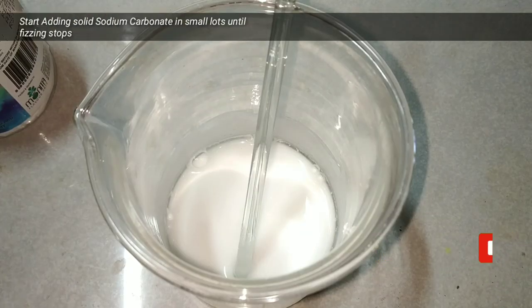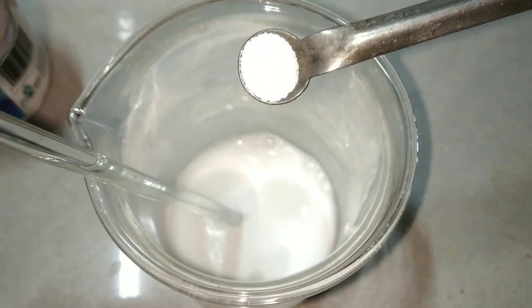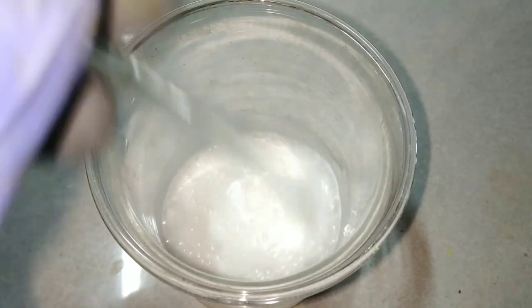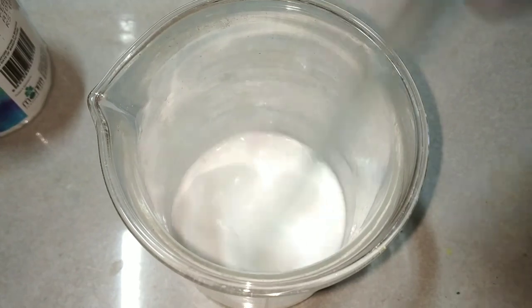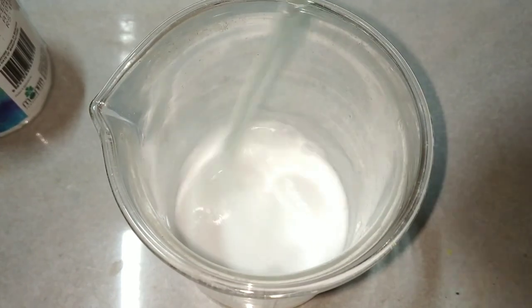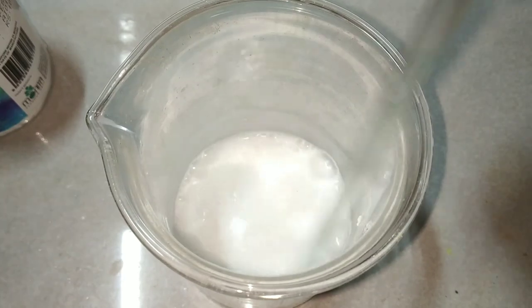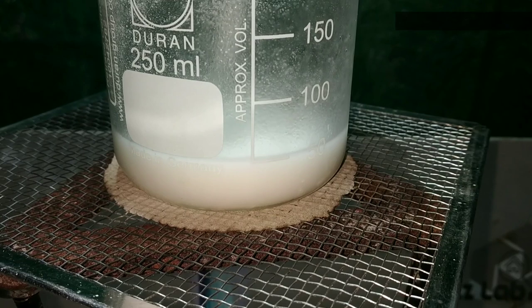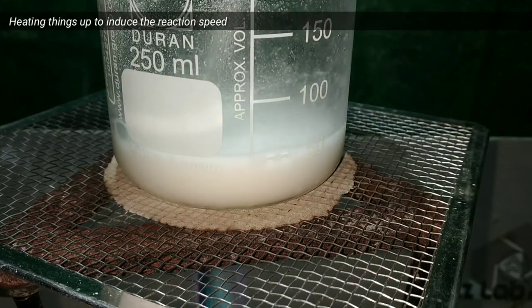Now start adding the solid sodium carbonate with the help of a small spatula, along with constant stirring. You can see that on adding the sodium carbonate there is a lot of fizzing and bubbling. Continuously stir with the help of the glass stirring rod to make all the suspended particles react with the sodium carbonate. You can see how the rate of the reaction increased on heating the solution.